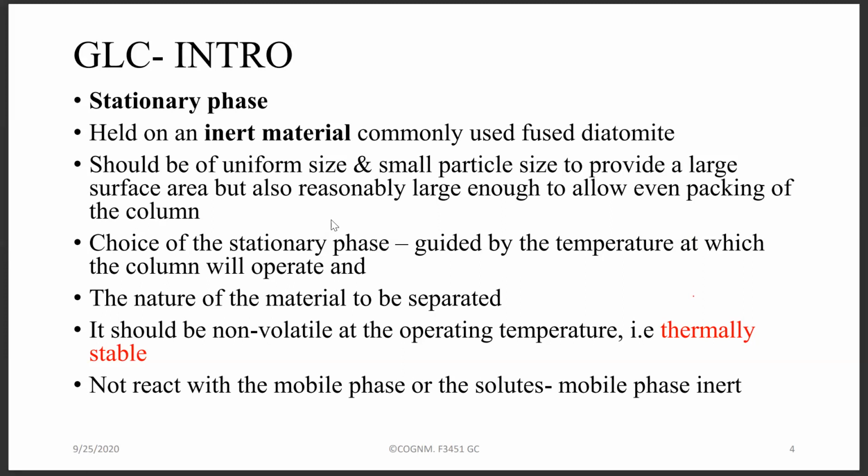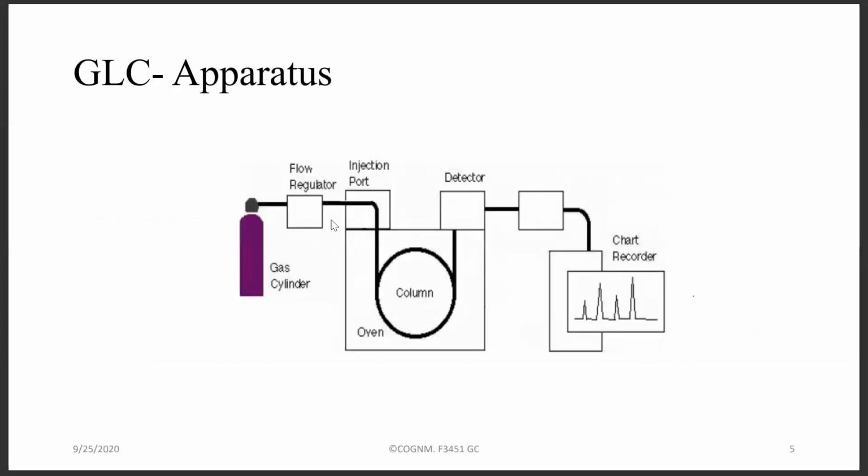And you should also not react to the mobile phase. I think that's clear. And the mobile phase itself should try and be something which is not reactive, something which won't react with anything. So this is the basic principle.